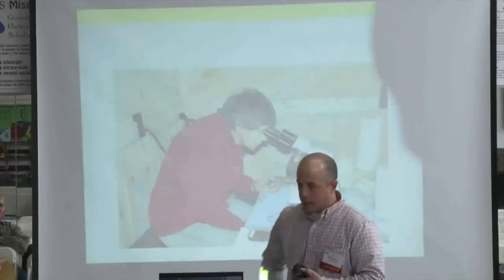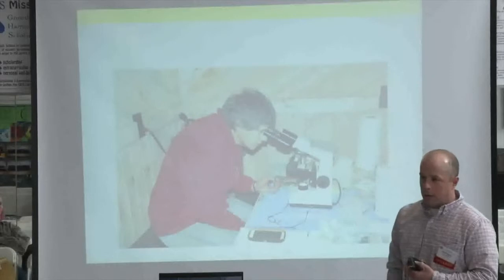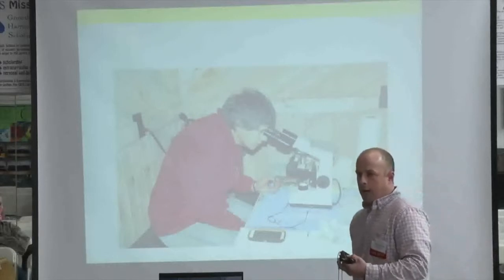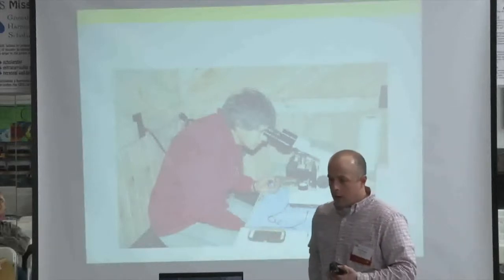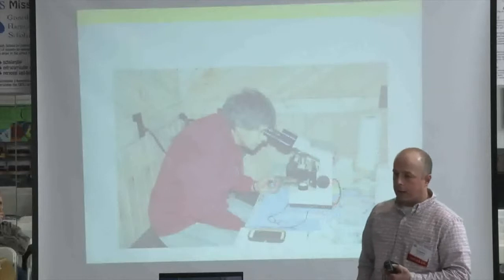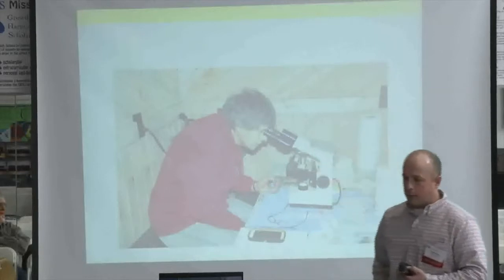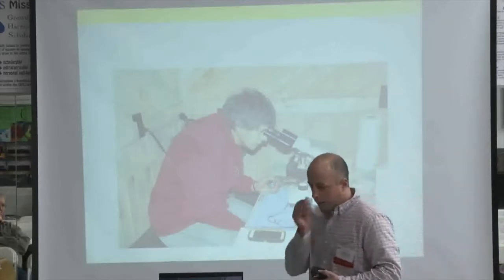at the semen under the microscope, looking for the morphology of the sperm cells. We wanna make sure that the sperm cells are properly made so that they can swim to do the job that they're supposed to do. And then also we look at concentration to see if the semen is concentrated. There might be cells there, but if it's really dilute semen, that's less number of ewes that can be bred then.